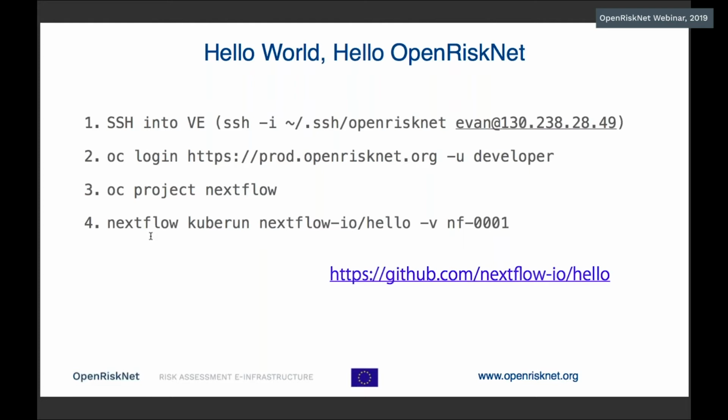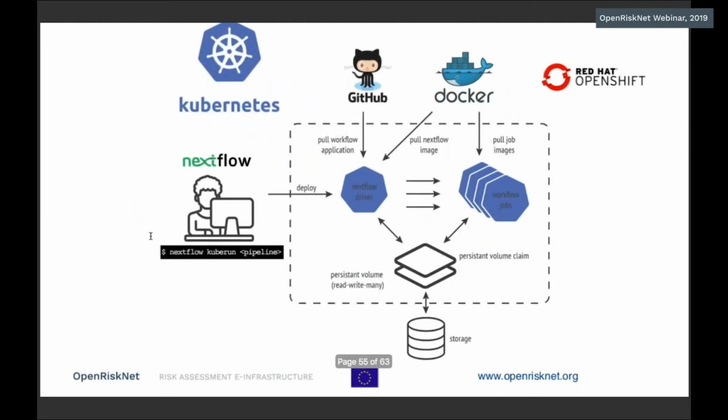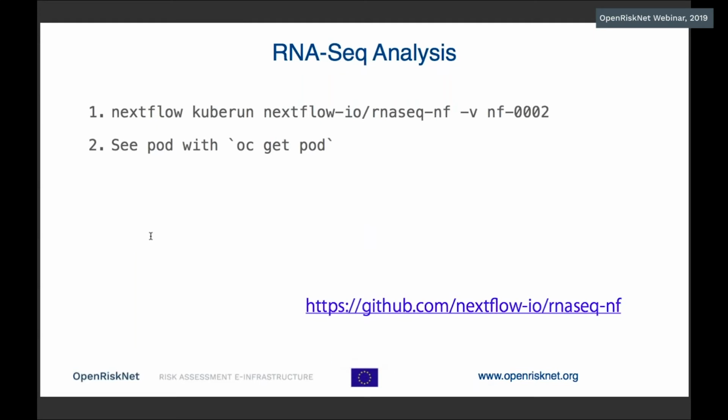So that you can be guaranteed that you'll get the same execution. So now let's step it up a little bit. Now let's do, in terms of transcript toxicogenomics, an RNA-Seq analysis.